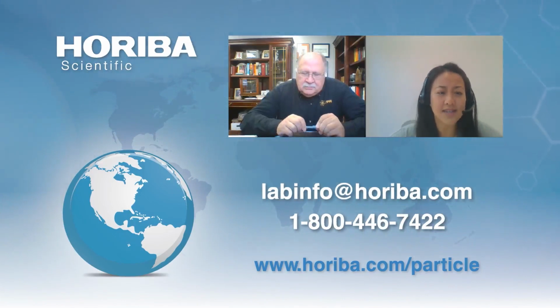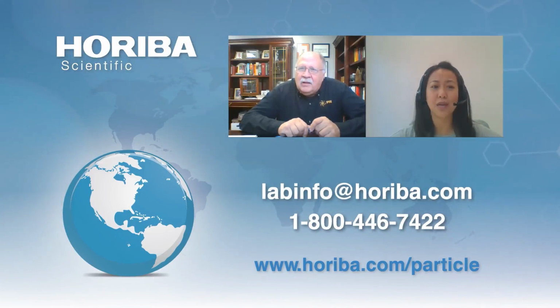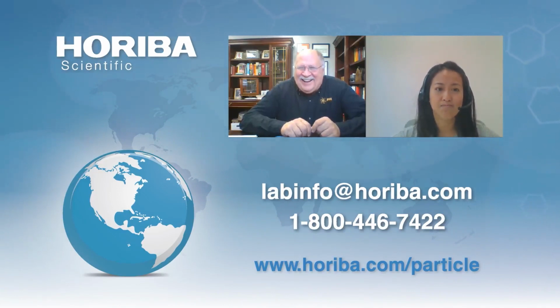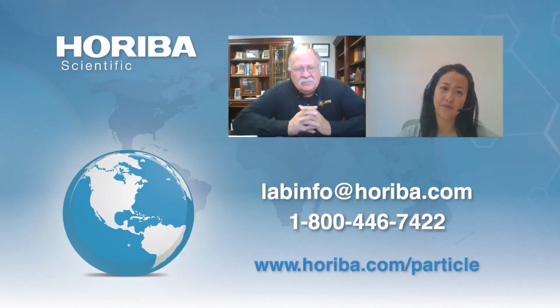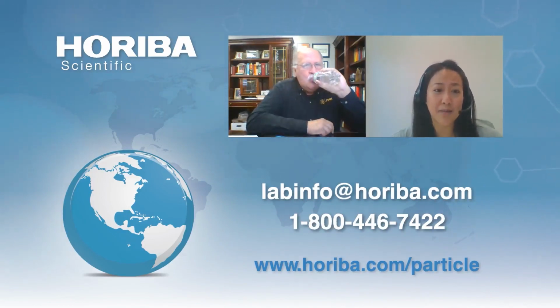The next question is, how is the number distribution calculated? I think this person is referring to the slide where you converted volume-based distribution to number-based distribution. That's a great question. I don't know. Julie could probably answer that better than Willie could. Yes, and it's a very loaded question, so I'll probably follow up with an email afterwards. But basically, when it comes to number to volume conversions, there's a way that we prefer to do it that's a little bit more accurate.